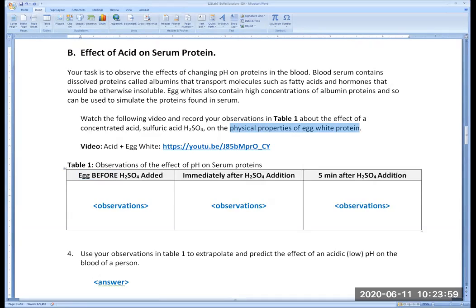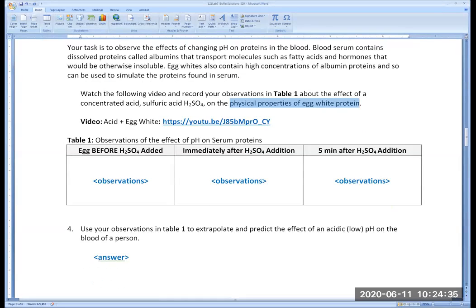I've noticed people tend to make some inference when we ask for observations. Sometimes students write what it means, what they conclude from the observation, but that's not what an observation does. An observation is only telling what you see, what you feel if you can touch or smell, all these things that you can feel, or see or hear.